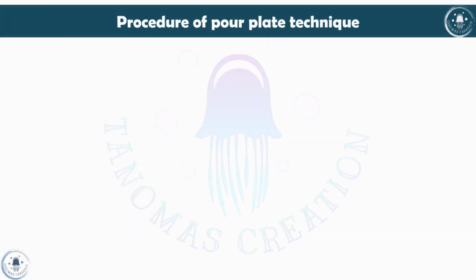Now there are two types of pour plate procedures. Both are easy, and you can follow either of them. Coming to the first procedure of this technique.